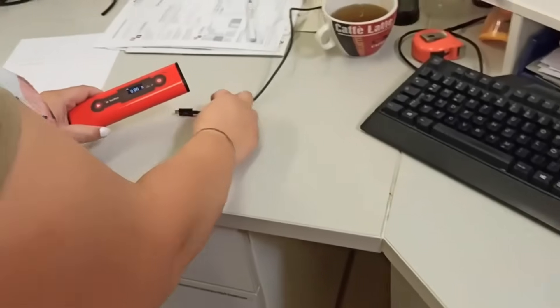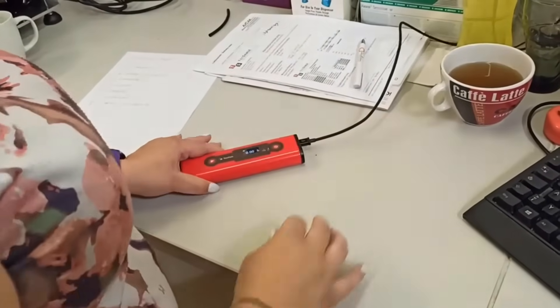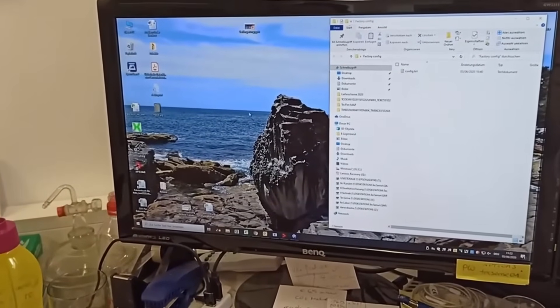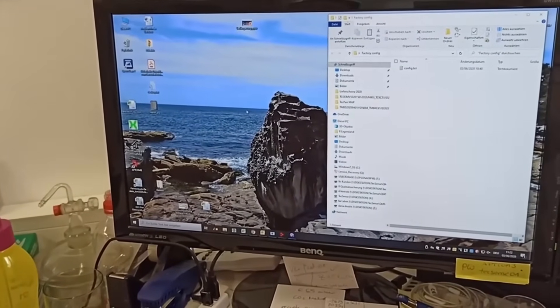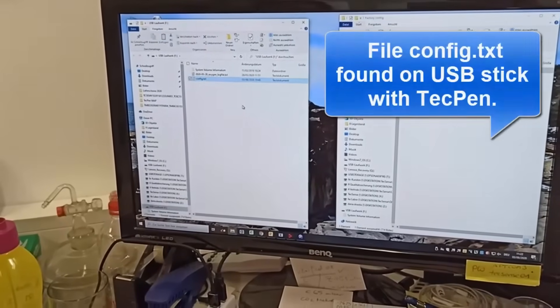Power on the TechPen and connect to the computer via the supplied USB cable. The TechPen can now be seen on your desktop. Prepare the file with the original config text file and drag the config file onto the TechPen.